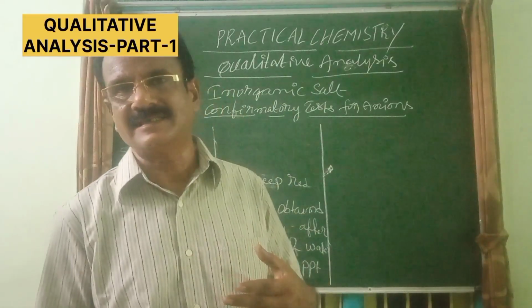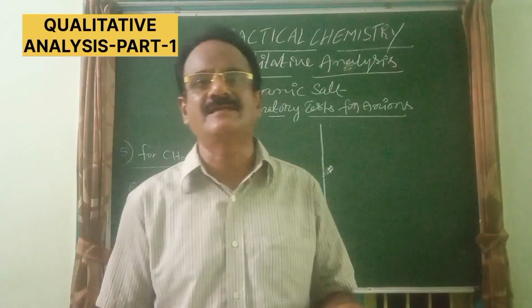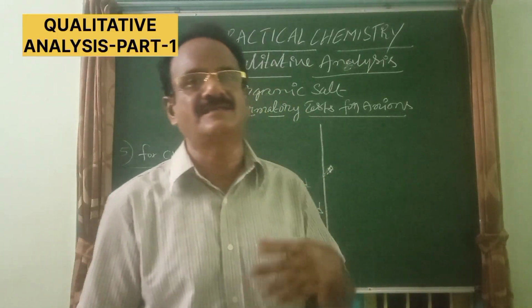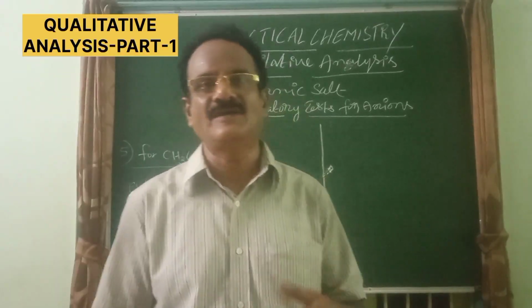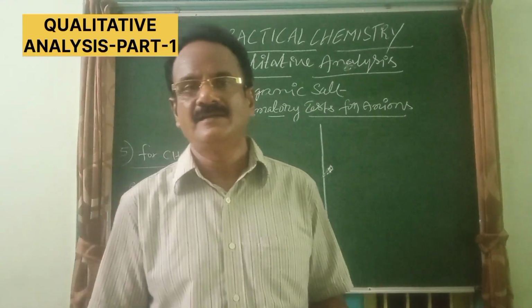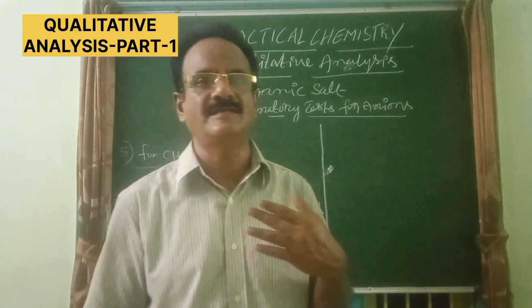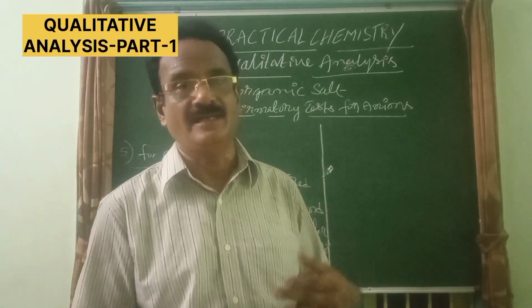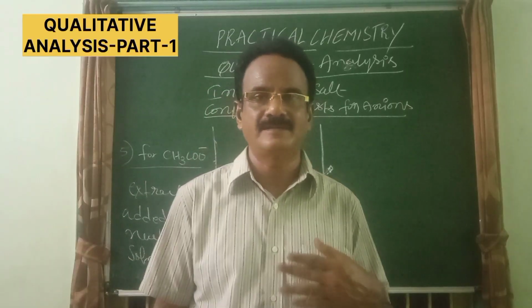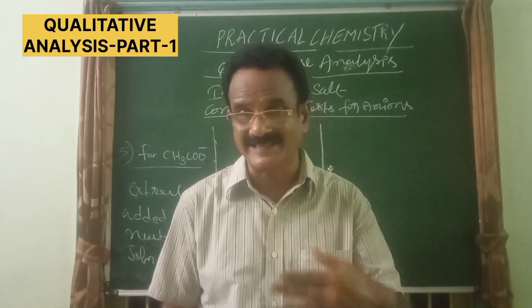The other test is the oxalic acid test. If you rub the salt along with oxalic acid, it gives a vinegar smell, because of the formation of acetic acid. If the salt contains acetate and you rub it with oxalic acid, you get a vinegar smell, due to the formation of acetic acid.